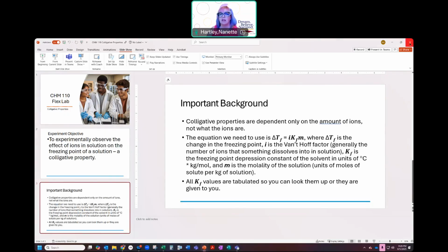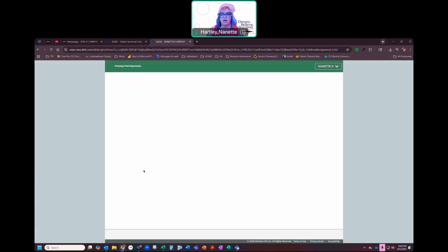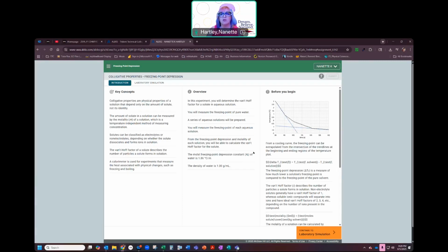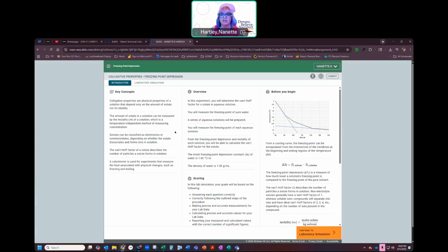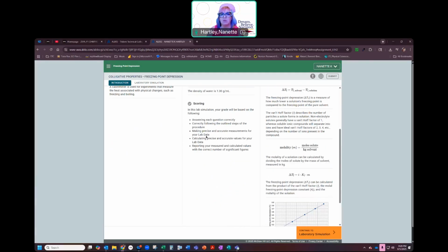So I'm going to close this out, and I'm going to take us in, and we're going to take a look at this freezing point depression lab. I'm going to go ahead and open this. And again, just like we always do, I'm going to start this. We'll get to some of our pain points, and there are a few pain points with this lab, some things that we need to talk about. So things that you will need to be able to look at when we're doing this.